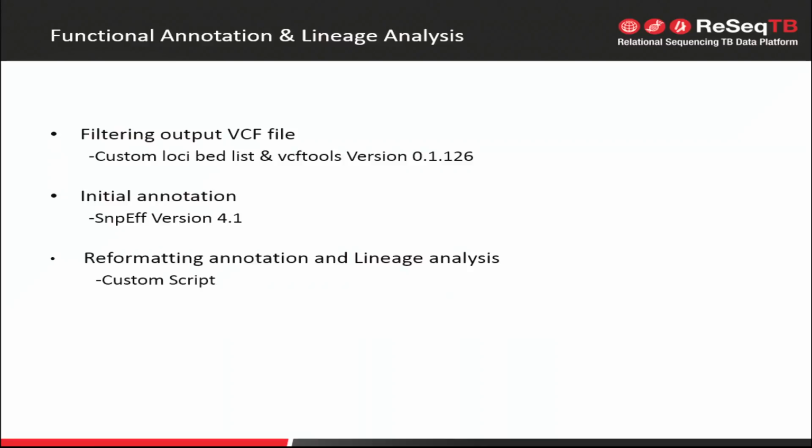So for the filtering, Sebastian had actually created a list of about, I think, 400 genes that we knew are problematic when it comes to reference-guided assemblies. These are the PE/PPE, PGRS genes, transposable elements, genes that have more than 50 base pair repeats somewhere else in the genome. So basically, all the SNPs that are found in those 400 genes or areas are eliminated from the variant call file initially, because we know it's not very reliable in that area.